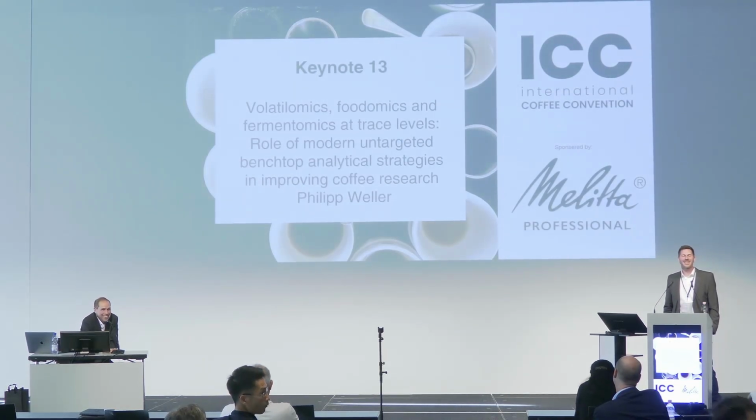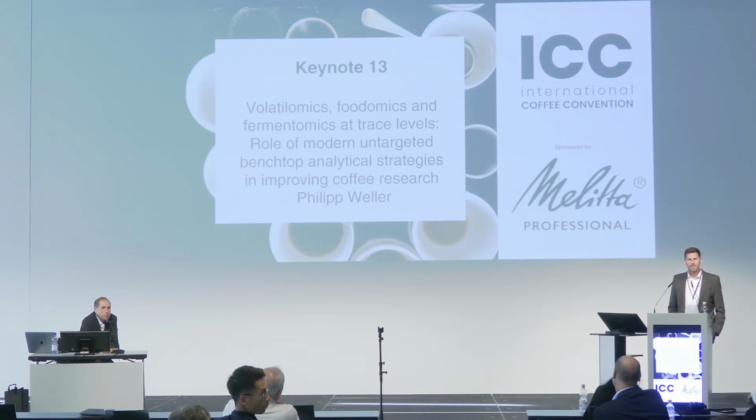Yes, but my question is also, would the technology be able to detect, for example, if I have roasted coffee that is from different dates? For example, freshly roasted coffee, which I understood is very volatile in terms of releasing gas, versus stale coffee, which is maybe a year or 2 years old. Would the results from the GC-IMS be very different? I'm pretty confident that it will be.